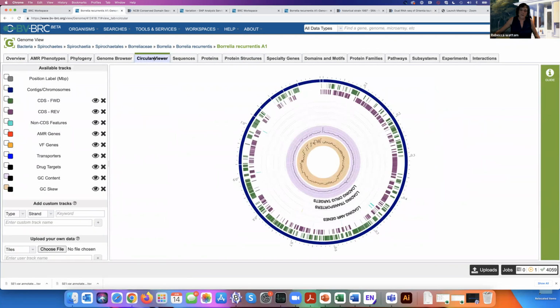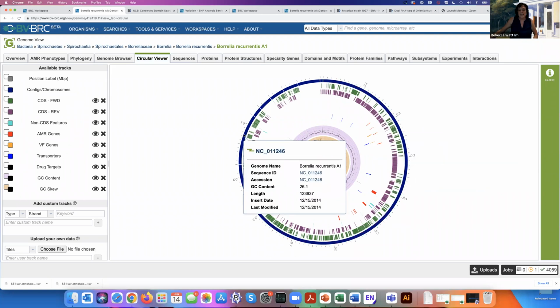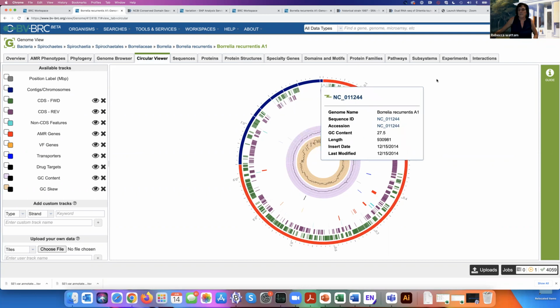And when I look at all the papers that cite the resource, this view is one I often see in the papers. This is the main chromosome, and these are each of the plasmids. And yes, it's a circular view. The other people did linear. I know some of us would rather have a linear view of this, but this is what we've got.